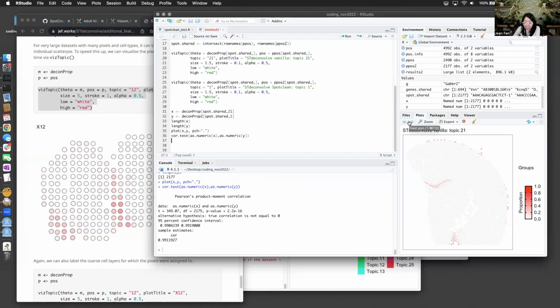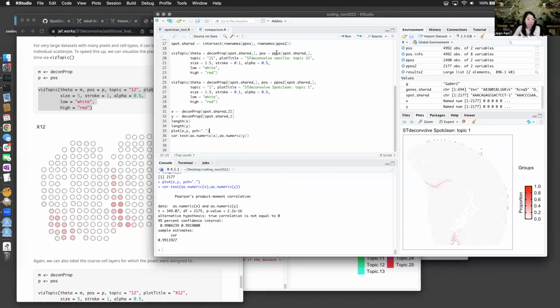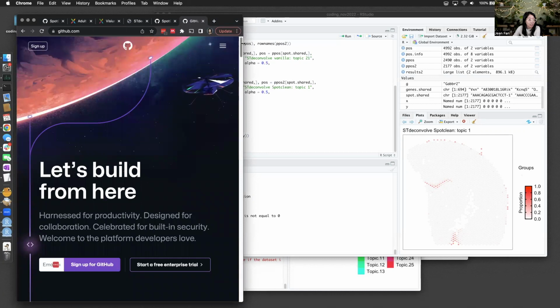I think it's a reasonable preprocessing step that is worth exploring. Again, if you have a tissue that has a lot of anticipated lateral diffusion issues. Cool. Yeah, so I'm just going to save these results. And let's see. Now, I think if I don't push these results somewhere, they're going to be lost forever.